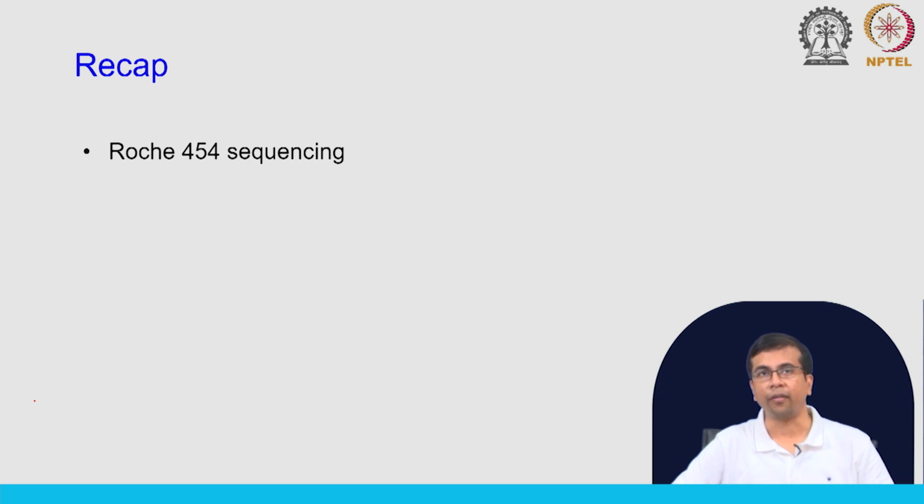And if you remember, we pass one base at a time. So, one type of dNTP we give, and we see if there is any signal or not, and this process happens at a very large scale across the picotiter plate. And that is how we get this high throughput sequencing.